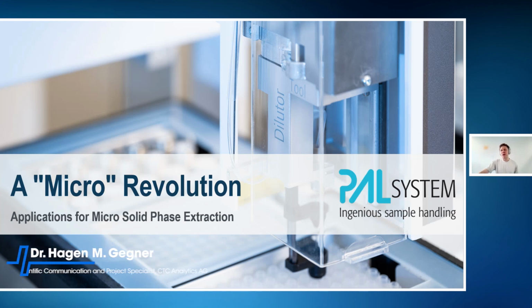Thank you so much for the lovely intro. Today we're diving into microsolid phase extraction, or µSPE. We will explore why this automated micro approach is so critical and see how it's being applied to a variety of analytical challenges.